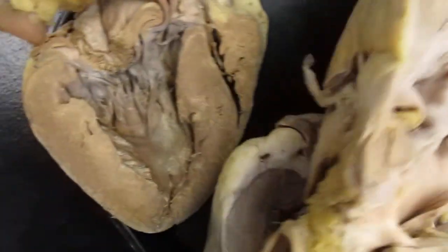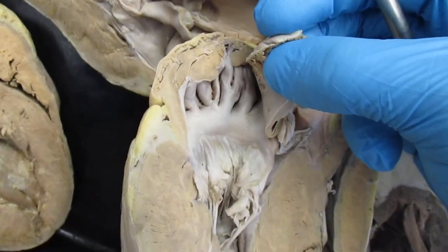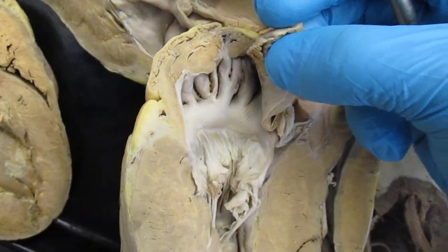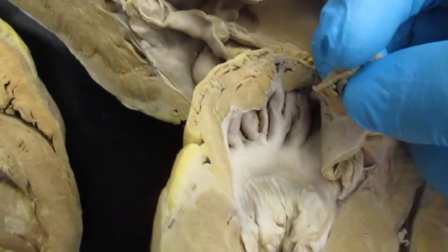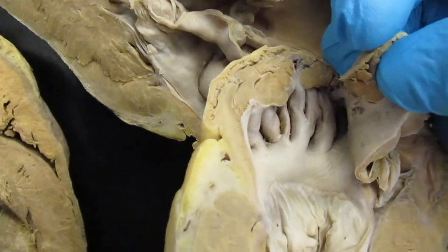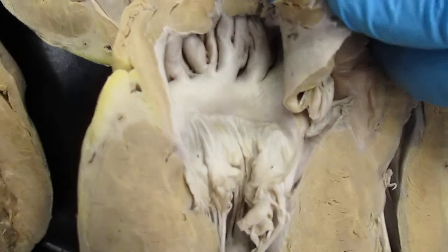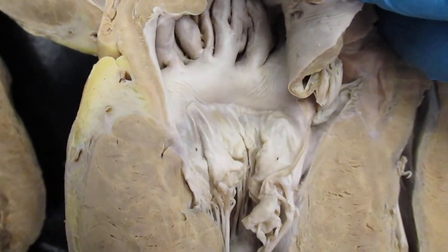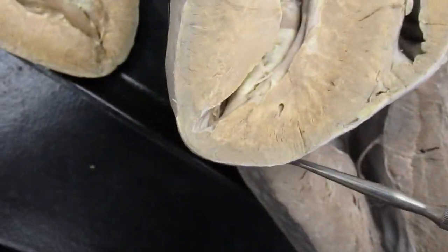Let's see if I can find it on another one. I need to show you this. I'm going to find it on another heart. But associated with the atria, you have the pectinate muscles. So what I'm pointing to with my camera are the pectinate muscles. Right here, remember, that's the bicuspid valve. And then chordae tendineae is right here, apex of heart.